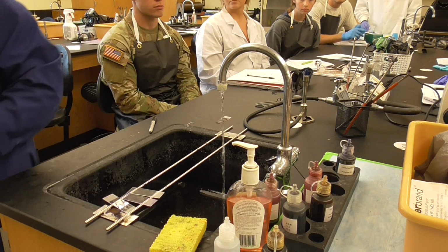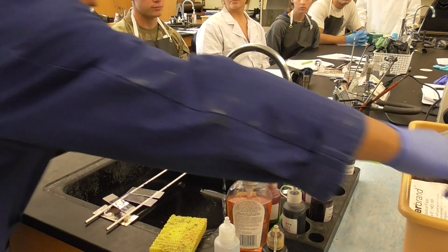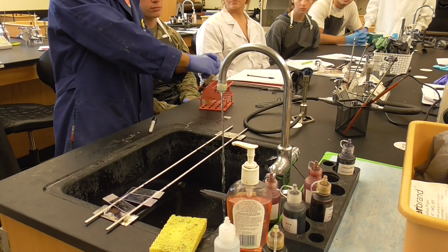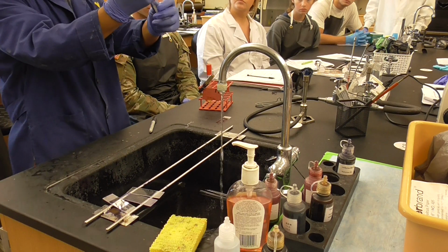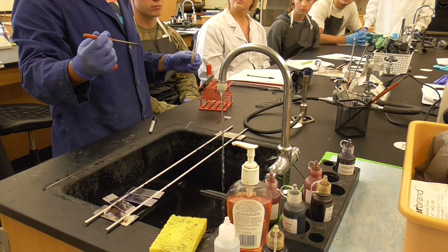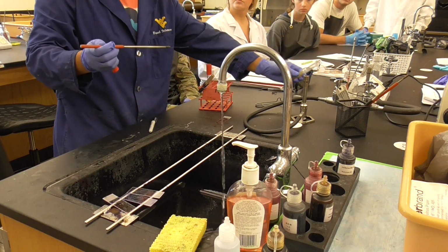Okay, then I put it here. Now I'm going to pick the bacteria. So how are we going to do this? I'm going to have two, which are Bacillus and E. coli, in this tray. Okay, we're going to show you again, but I'm going to tell you right now how we're going to do it. You hold the loop with your little finger. Attach it, detach it, and flame it. Okay, this loop you have to flame again before you do. Then flame it again.